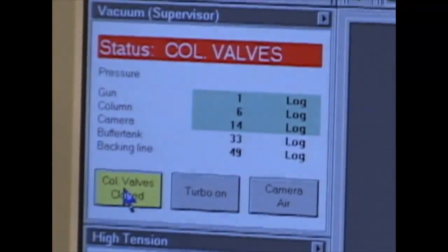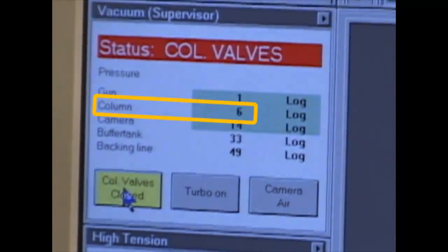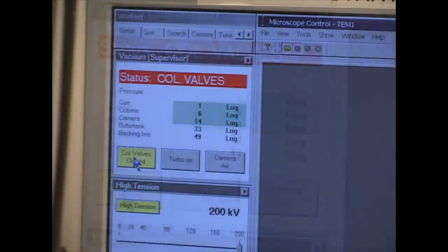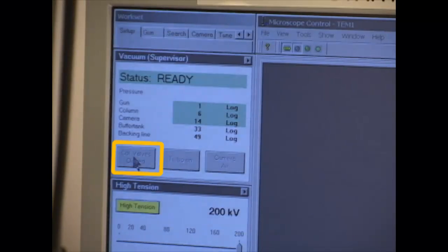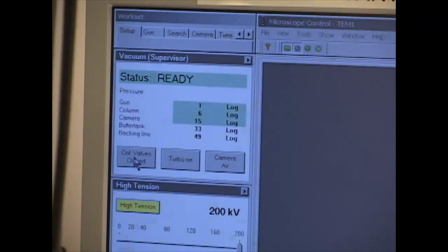After the holder has been inserted, the vacuum in column should read 6, and you can start to adjust the beam. Click the Column Valves Closed, and the button changes from yellow to gray, and the status reads Ready.